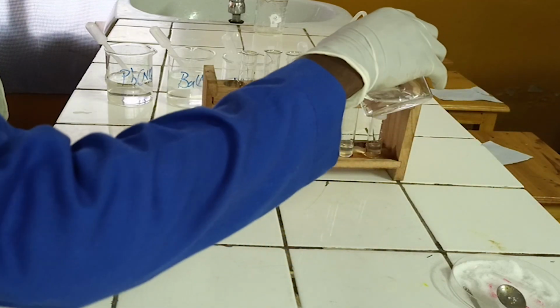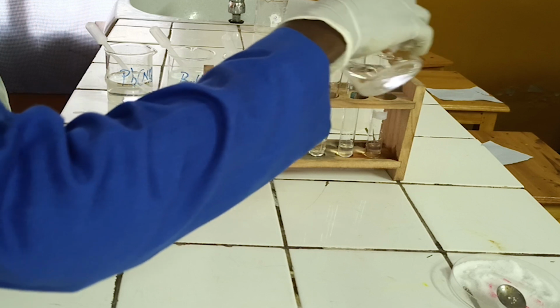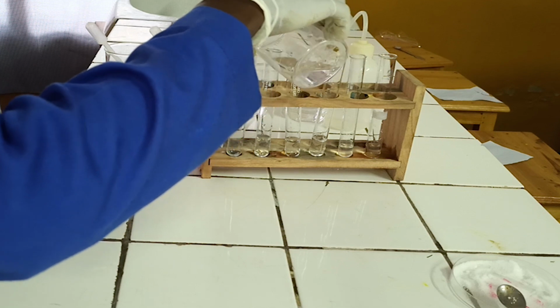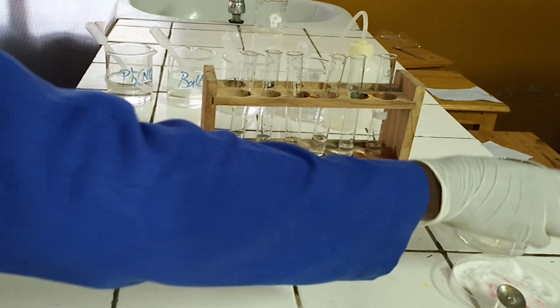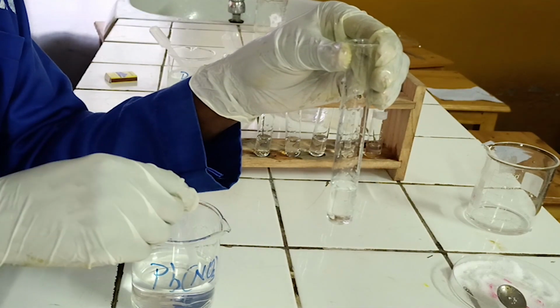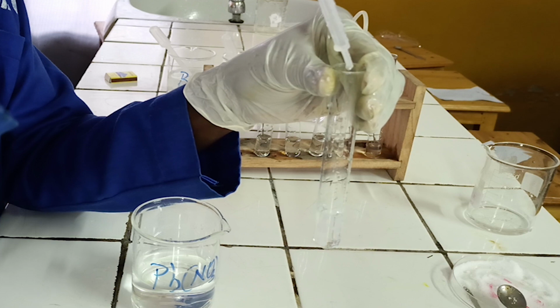Second step, divide the solution into test tubes, pour around 5 ml in each test tube. To the first test tube, add a few drops of lead nitrate solution followed by diluted nitric acid.